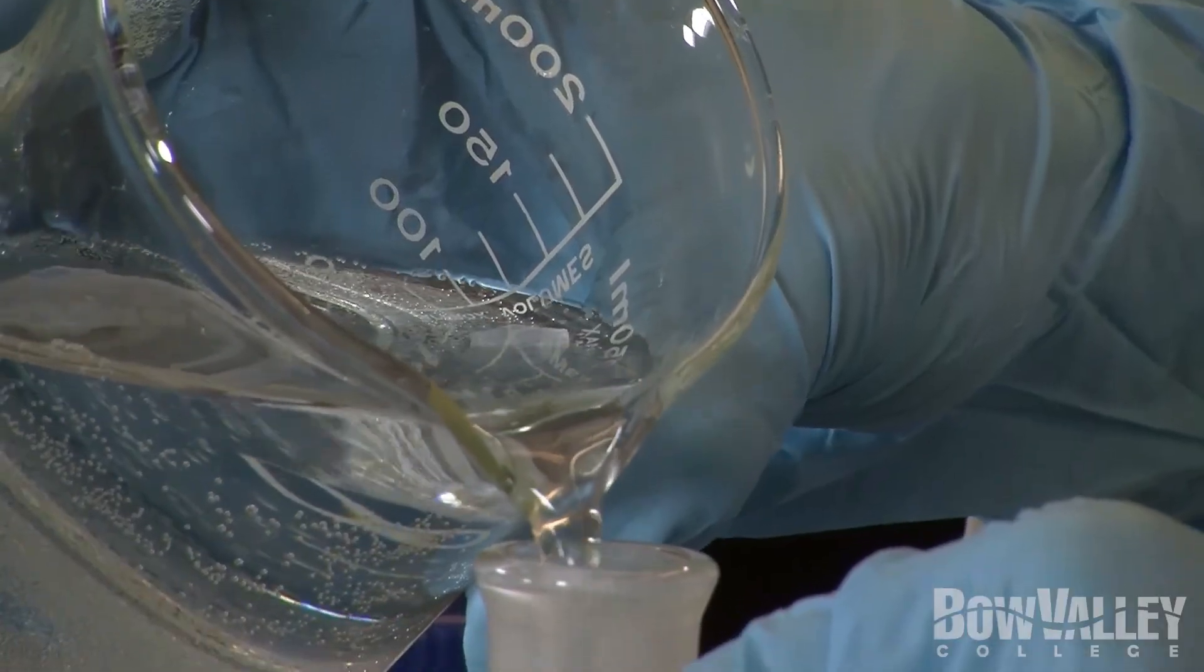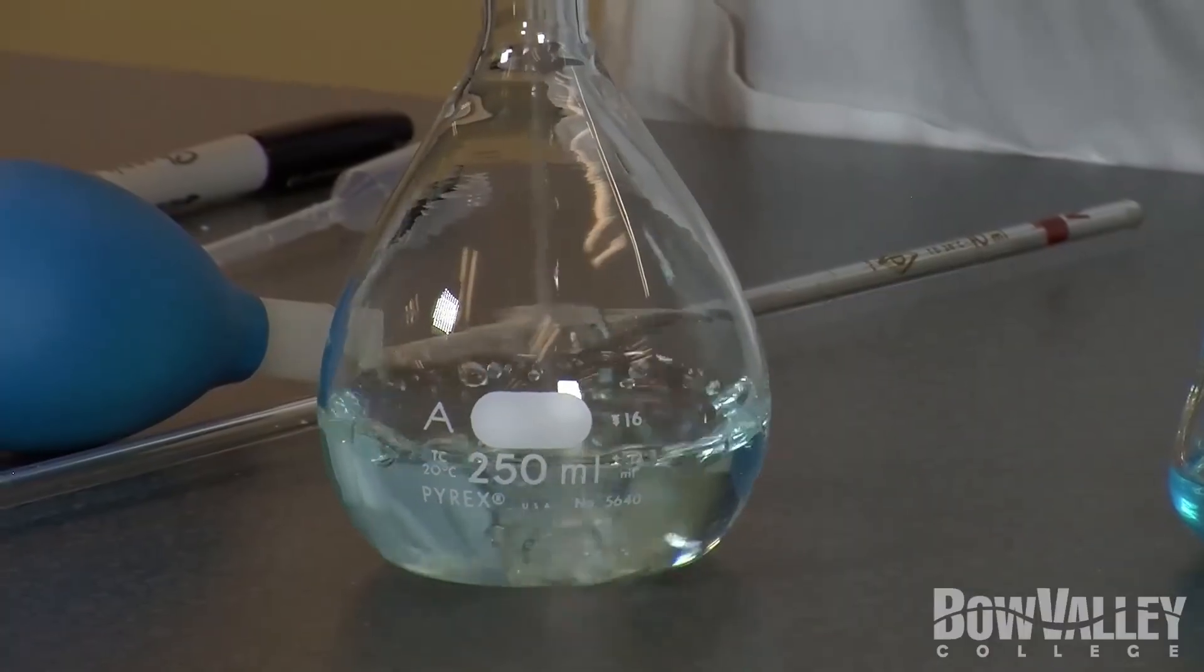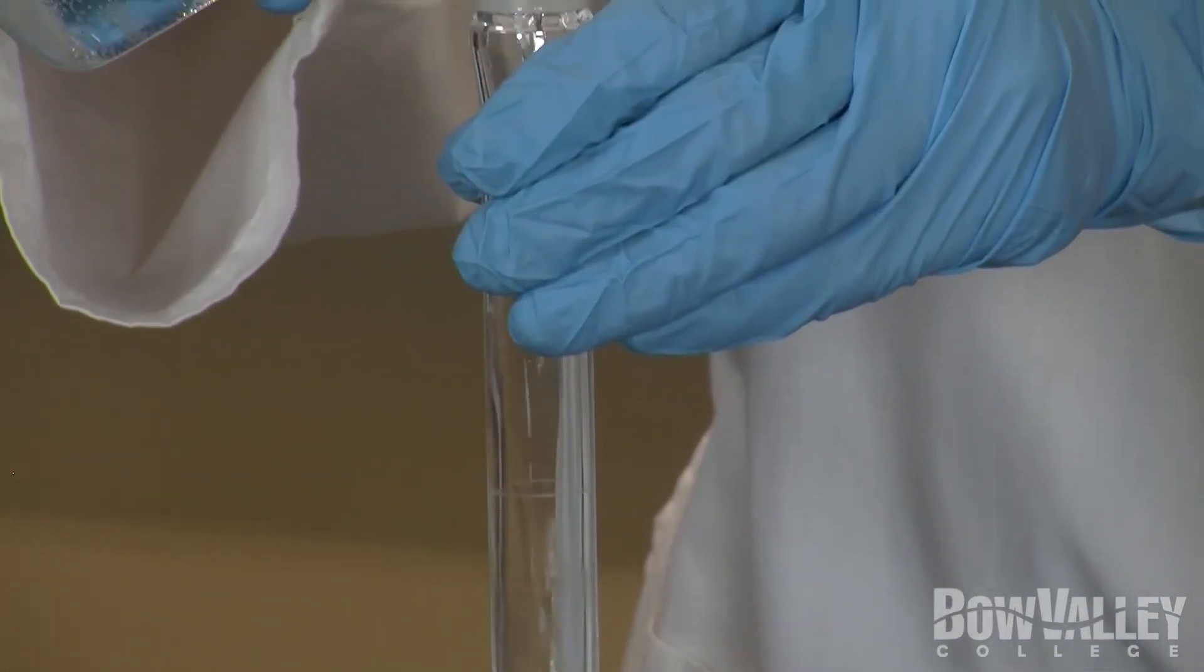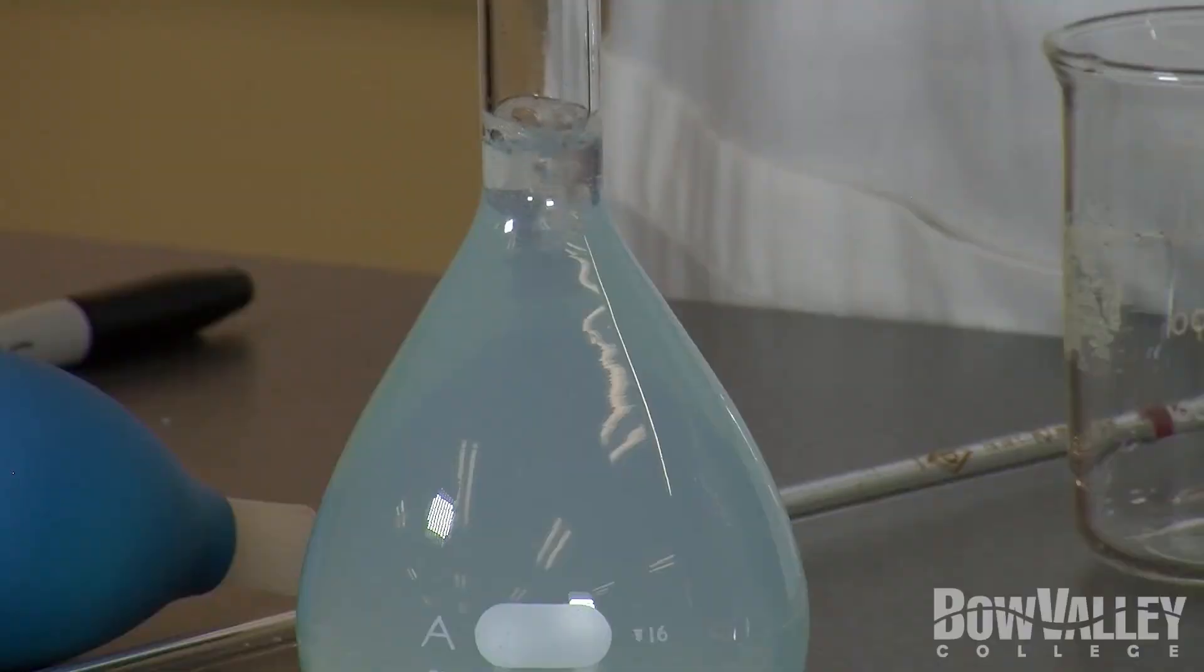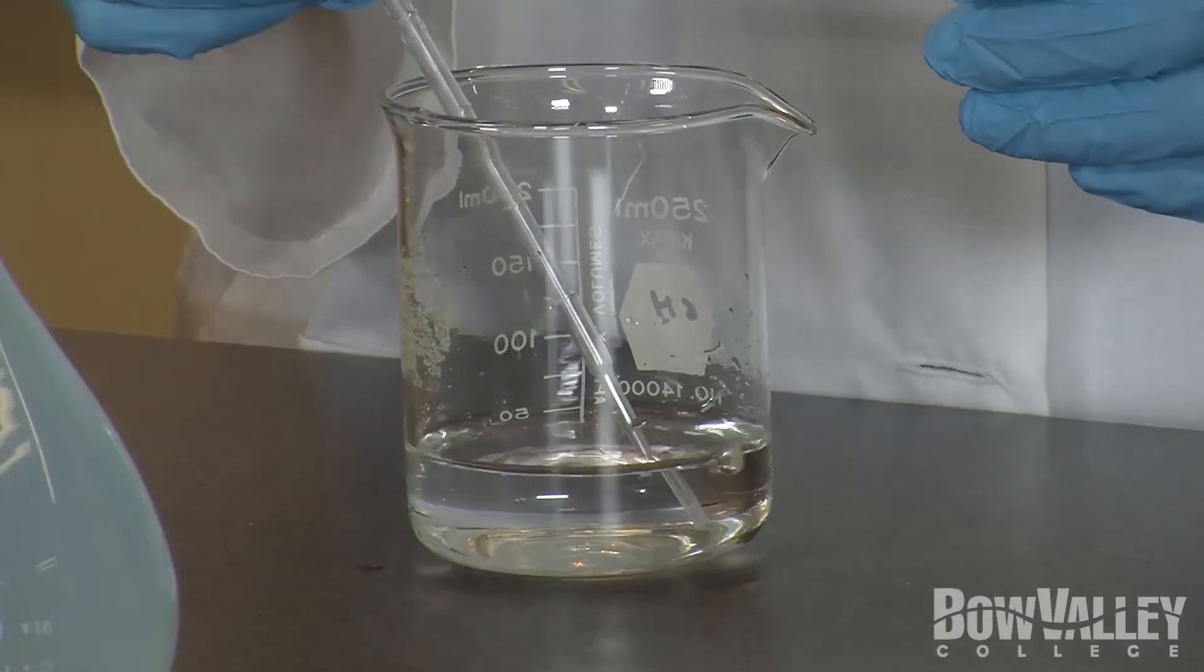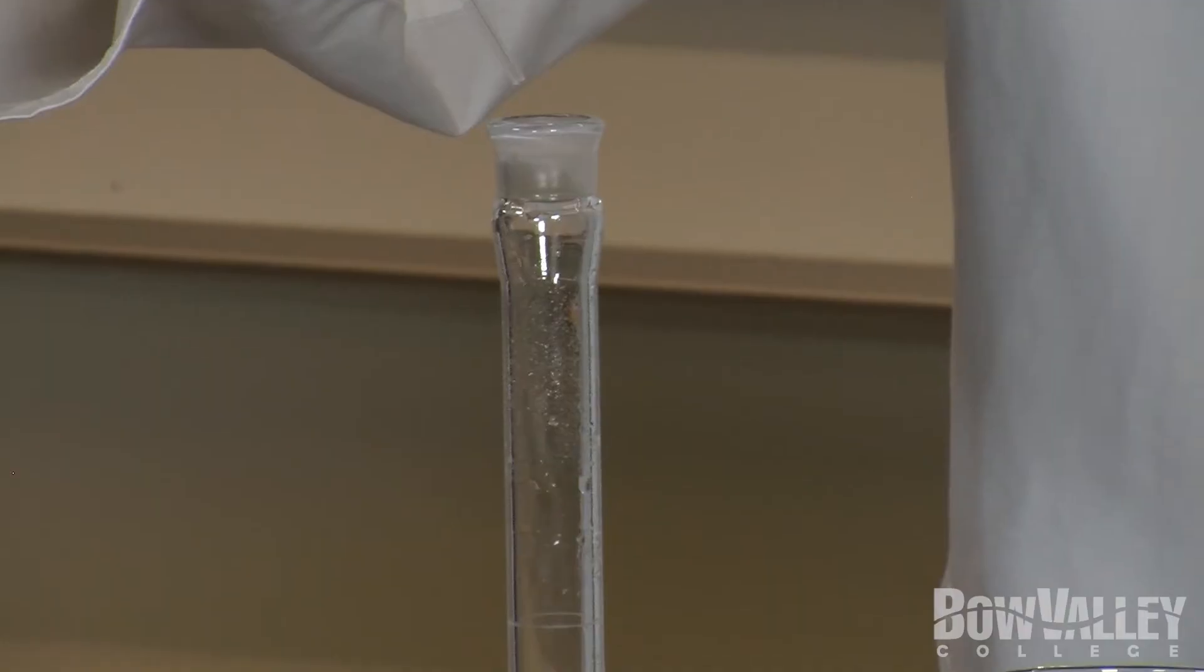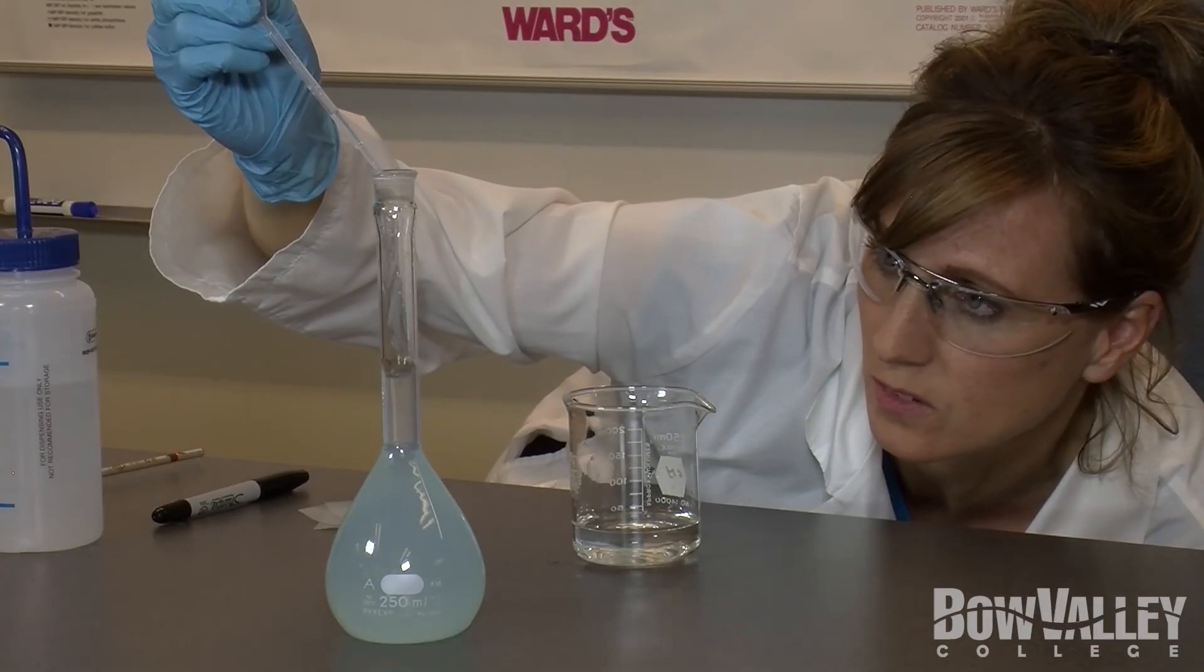Using the same procedure as before, we now add distilled water to the flask. Monitoring the level and using a disposable pipette for the last few drops. Once again, the bottom of the meniscus should be sitting on top of the line marked on the neck of the flask.